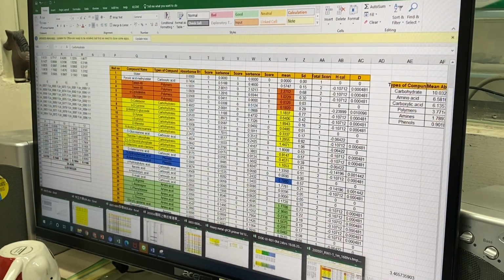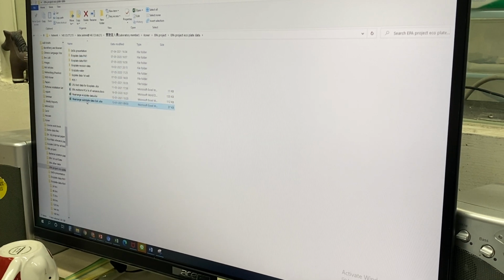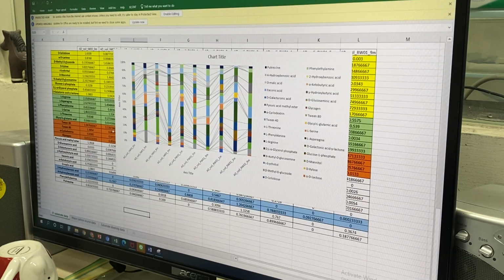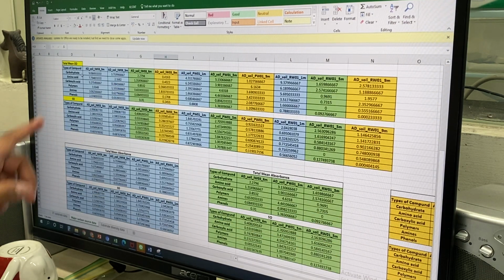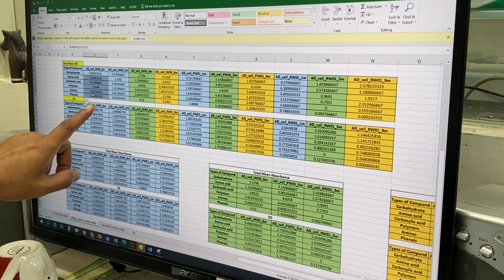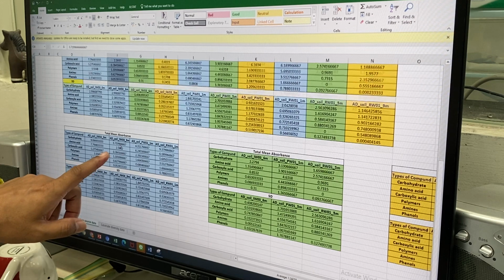So just do it, and I go again to Tony's data. You can see substrate. So you can check my data. So I put it right there. Carbohydrate, phenols. So this is our mean value, okay? All I put, you can see total absorbance is there.